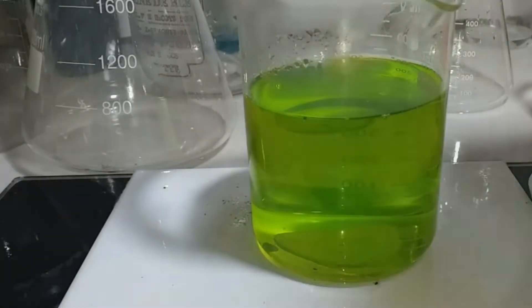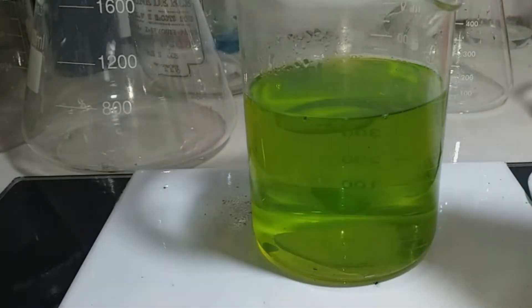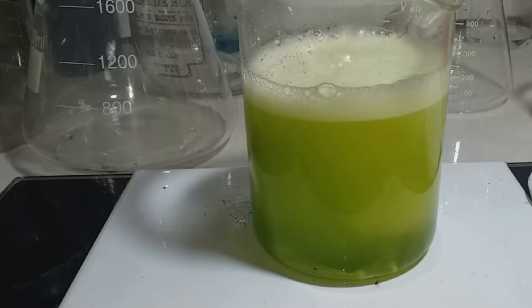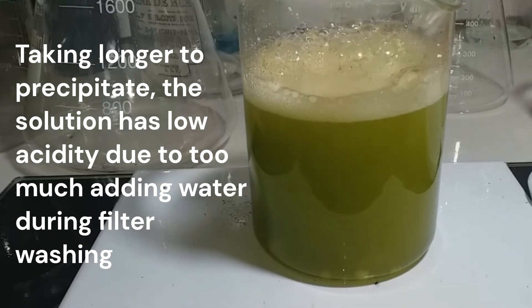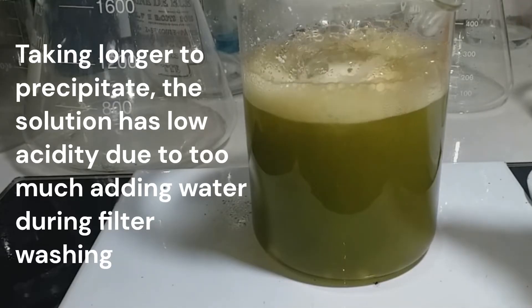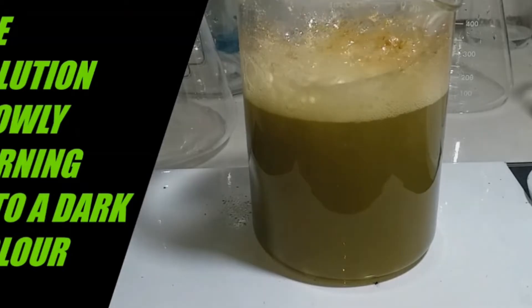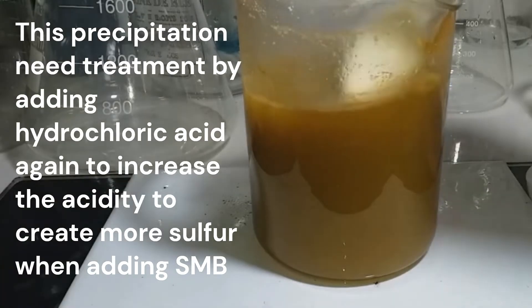We look back at our precipitation from cell phone connector gold recovery to see what happened. We observe there's no nitric acid here. It is already forming at the top, and I know this is because of hydrogen peroxide maybe. It's a very slow reaction, and maybe because of low acidity — look at that.